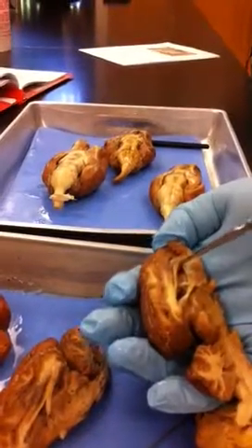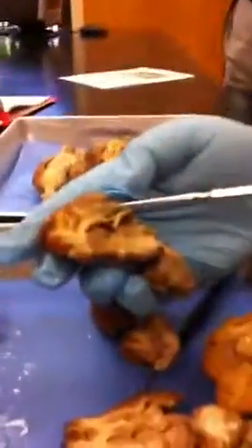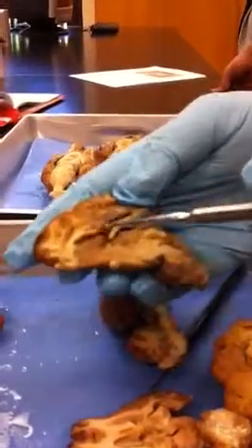This one's actually kind of split away. It shouldn't look like that. It should be all connected right there. But it's getting older, and if you look at one of these, here's another lateral ventricle. You can see corpus callosum there.